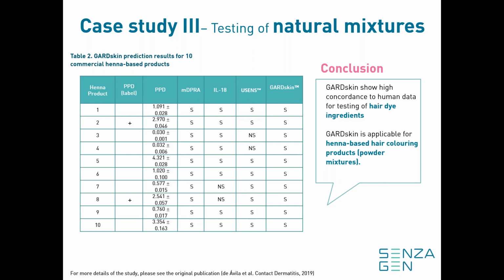But I think this case demonstrates that the GARD assay is well applicable to hair dye ingredients with a high concordance to human data, and that the GARD skin assay also should show very good correlation to other in vitro assays for testing of these commercially available mixtures.